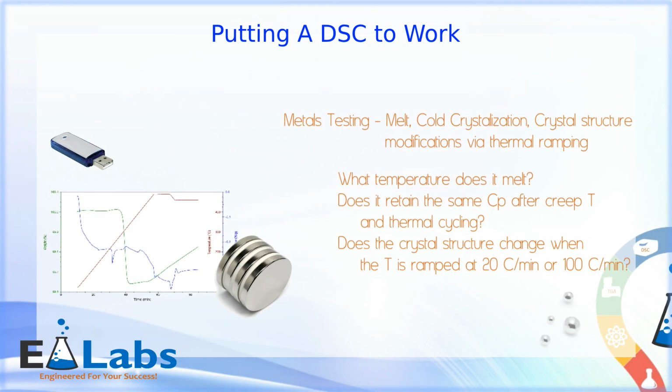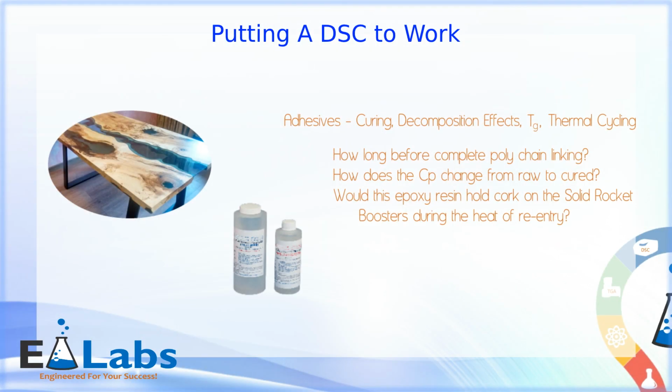Metals can also be tested in a DSC. After all, the calibration standards are metals. Simple melts and crystallizations is about the general limit for a DSC, but a few think-outside-the-box researchers are using a DSC to understand how a metal's crystal structure affects inherent thermal properties like heat capacity by quick cooling a metal sample in order to generate alternate crystal structures. Additionally, adhesive curing and thermal cycling effects can be studied.